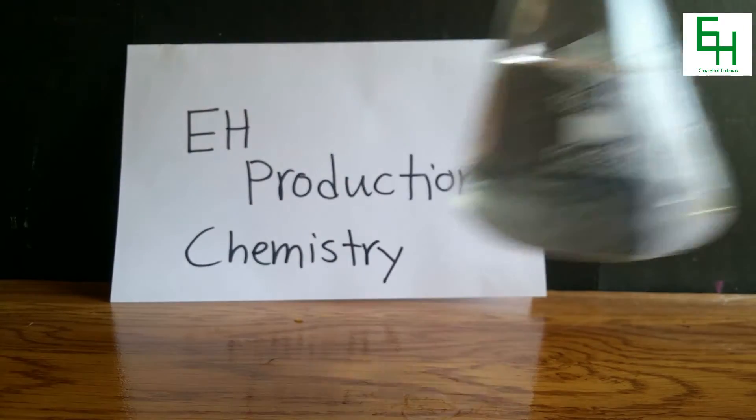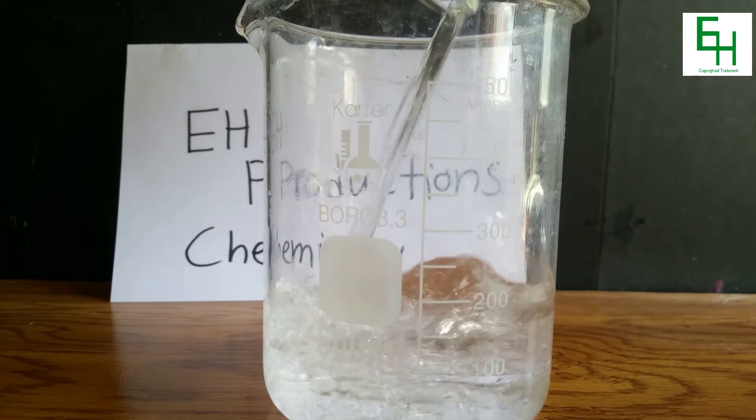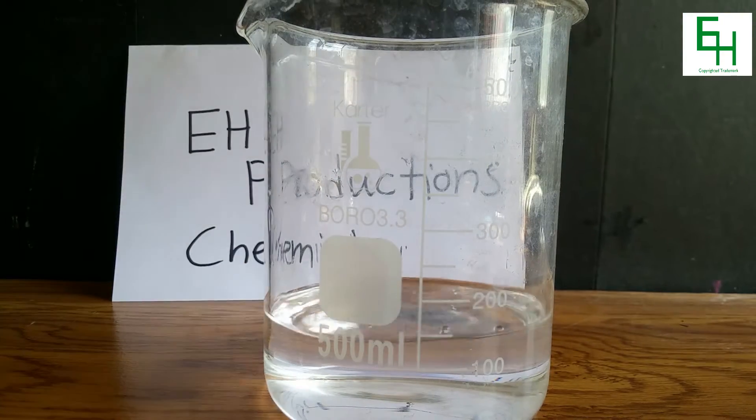So what you want to do now is pour that into a beaker. Just pour out that measured alcohol into a beaker.